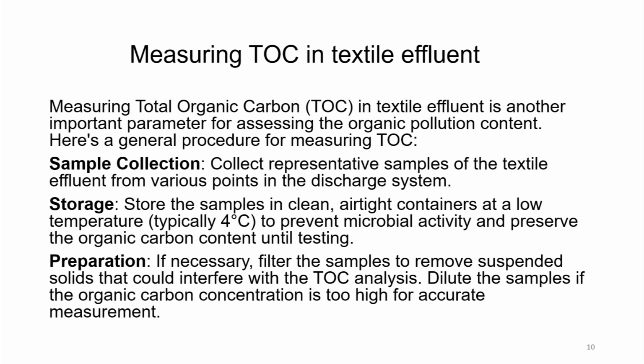Measuring TOC. This we had not done in detail, so let us look at how measurement of TOC, which is total organic carbon, in textile effluent is done. It is another important parameter for assessing the organic pollution content. Here is a general procedure for measuring TOC.